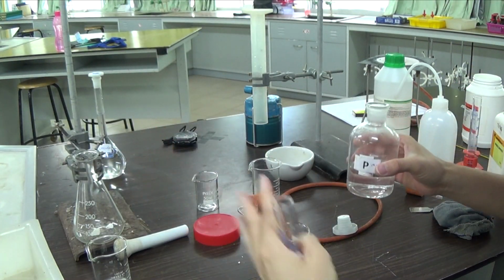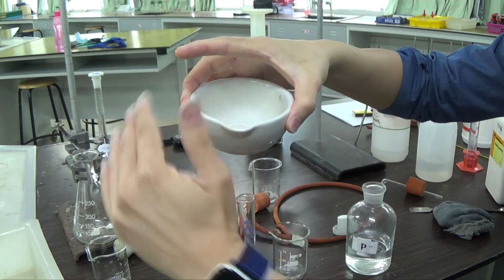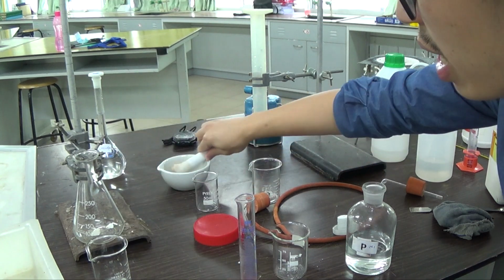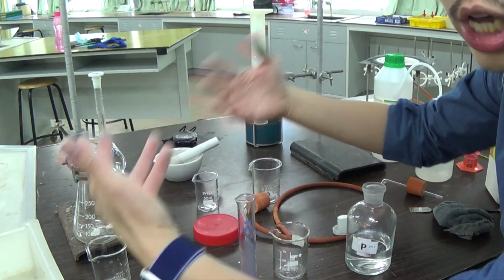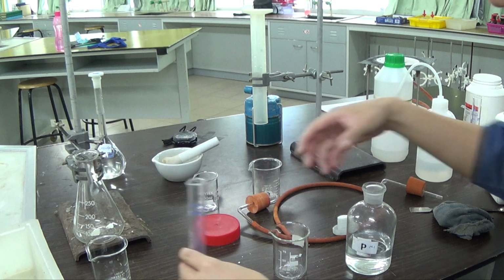What I'm changing and investigating here is basically surface area. So this is a powdered solid, with a much larger surface area compared to this lumpy solid from before I crushed it. They had the same mass because I don't want to change anything. I want to make sure that the mass of the solid is the same when I compare the two different experiments.